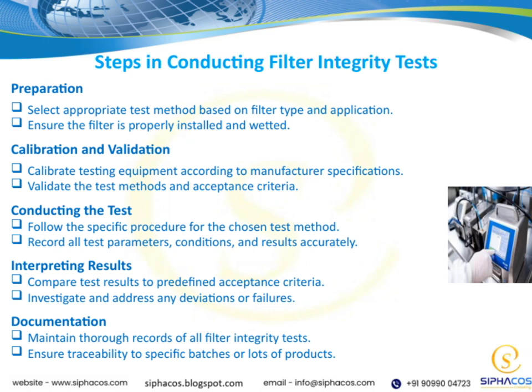Finally, documentation plays an essential role. Keep thorough records of all filter integrity tests performed, including calibration logs, test conditions, and results. Proper documentation ensures traceability back to specific batches or lots of products, which is critical for quality control and regulatory compliance. In summary, these steps: preparation, calibration and validation, conducting the test, interpreting results, and documentation, form a comprehensive approach to conducting reliable filter integrity tests that support overall product quality.